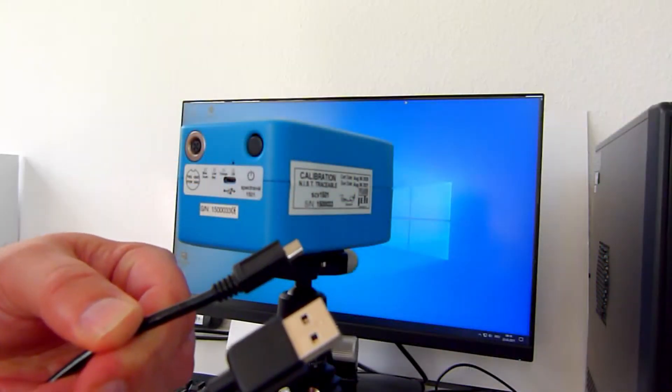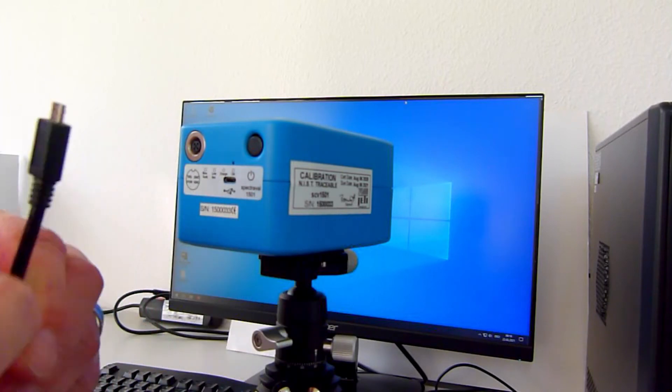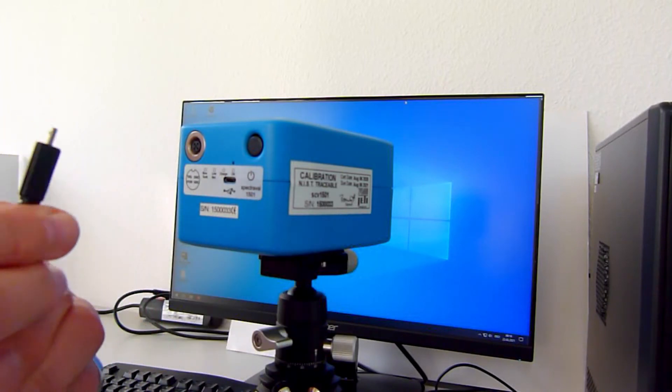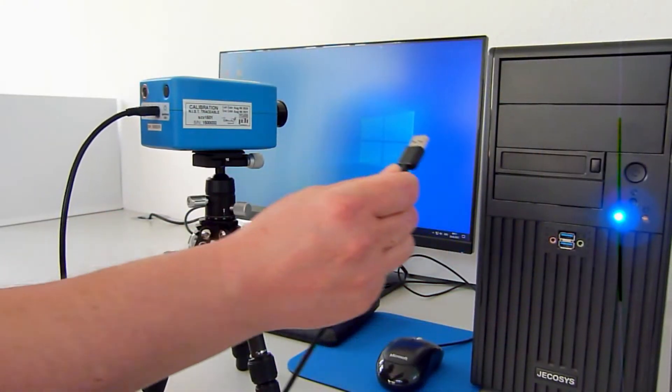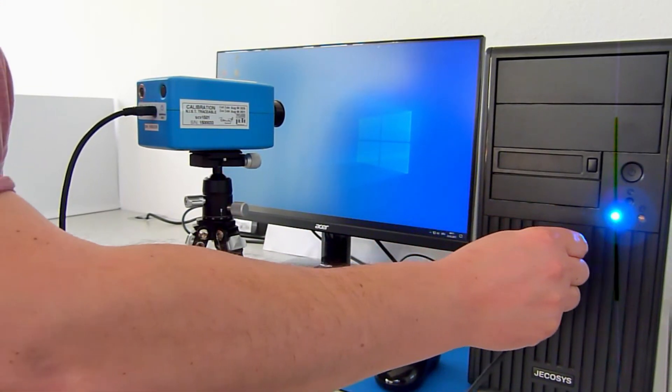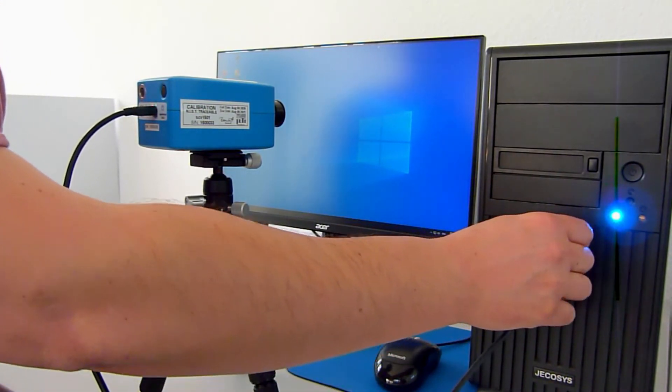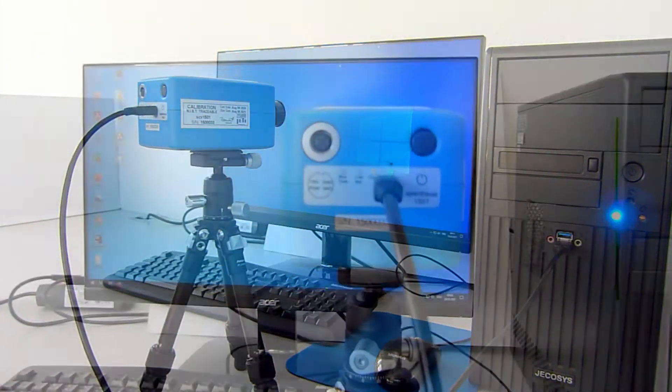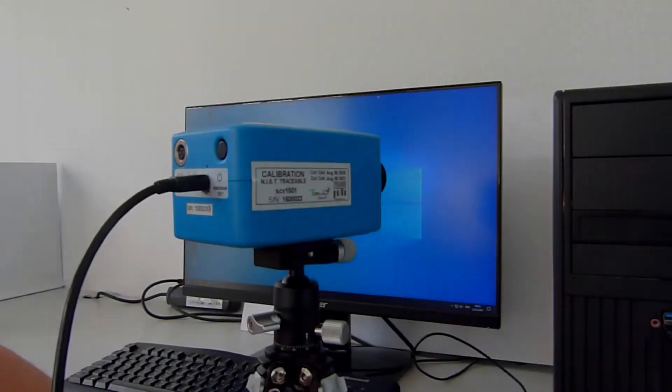Connect the device to a USB interface of a PC or laptop. If the green LED lights up, the device is ready for operation.